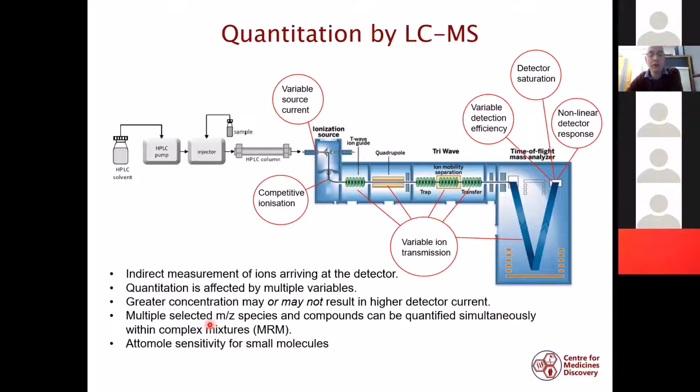You can quantify multiple species, multiple m/z species within a complex mixture by multiple reaction monitoring, and we'll look at that. And also you have the advantage that you can experience attomole sensitivity for small molecules by MS quantitation.